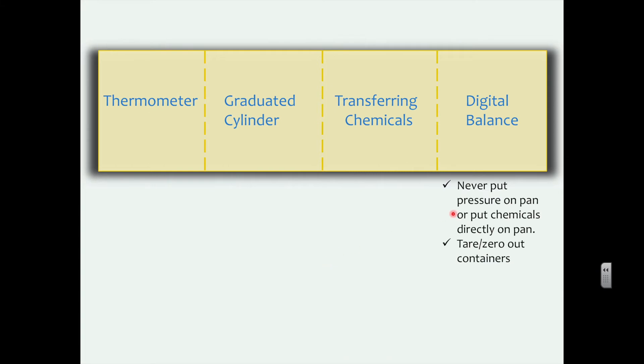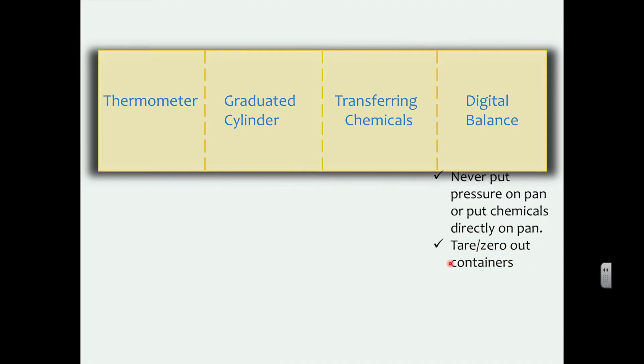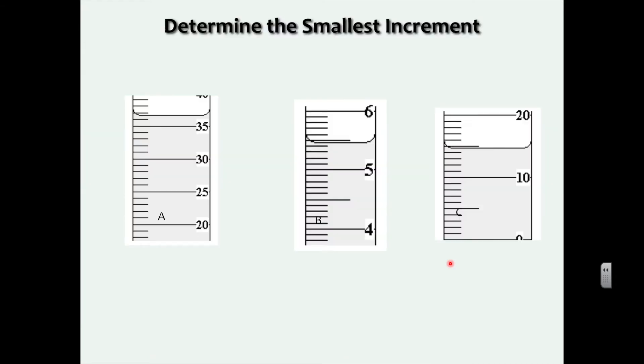So for a digital balance, please don't ever put your pressure on the pan, directly on the pan, and don't put any chemicals on it either. That's kind of gross, and you could ruin it. And some of them are expensive. And also please tare or zero out the containers, so you don't measure the mass of the container. So that takes a little bit of practice when we start working on it.